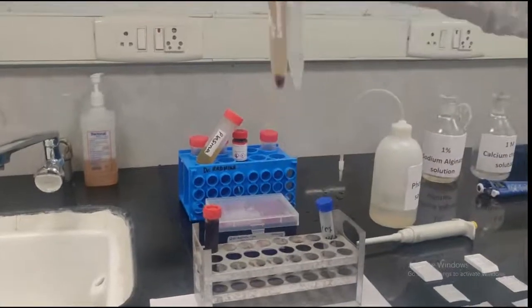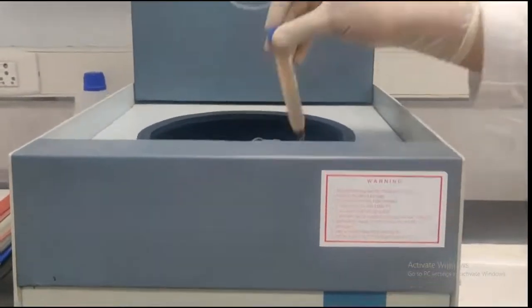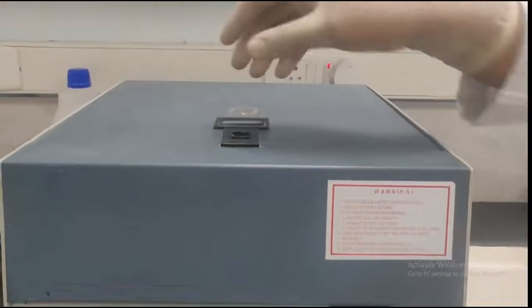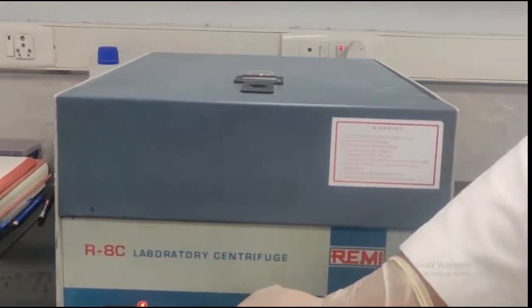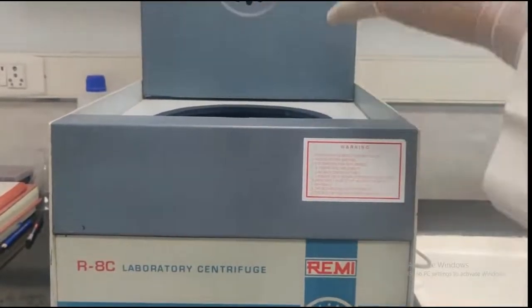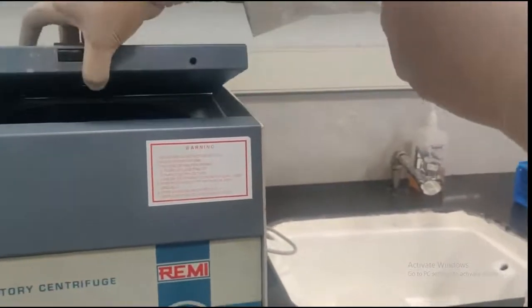So now these samples will be centrifuged. This is our final third centrifugation for this washing step. Again same speed, 3000 rpm for 5 minutes or 1500 rpm for 10 minutes. So now the third centrifugation is over. This completes our washing step. Now the supernatant will be discarded.